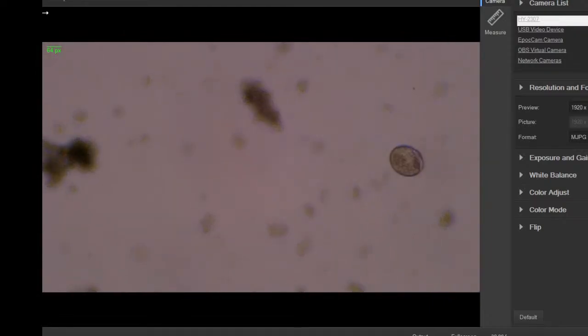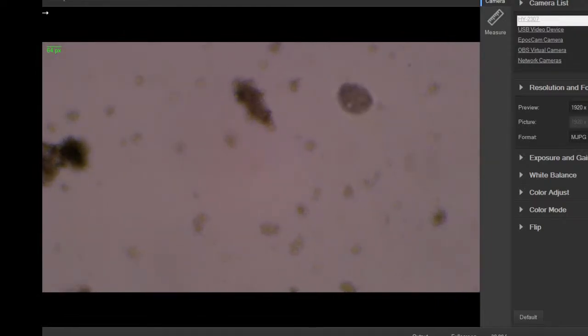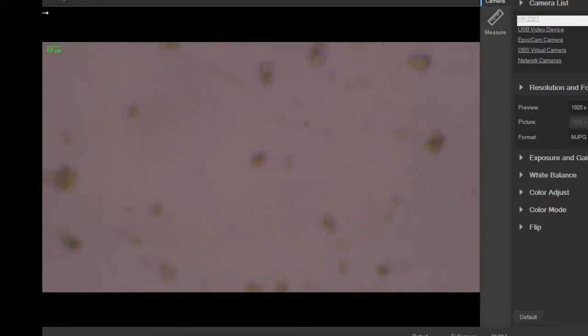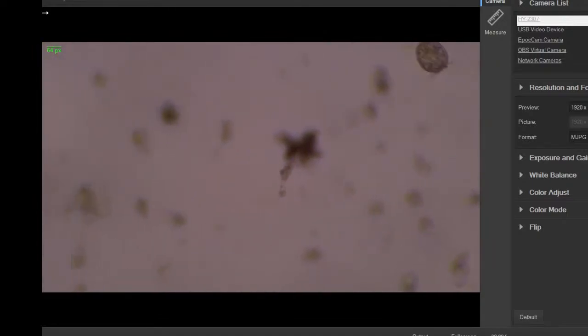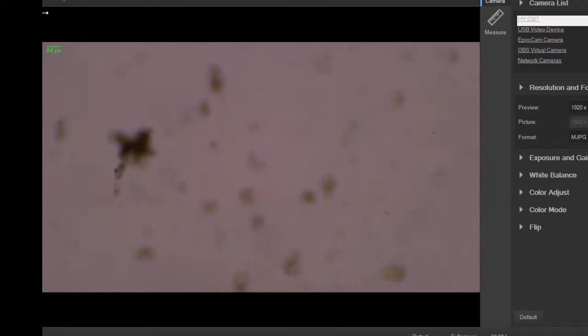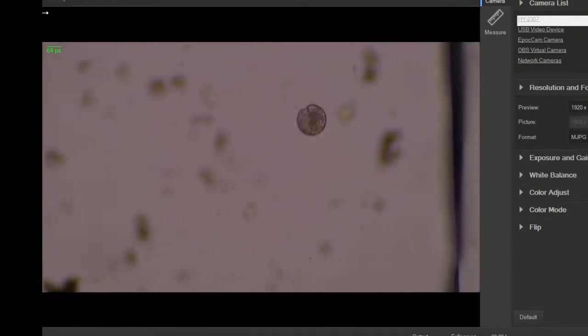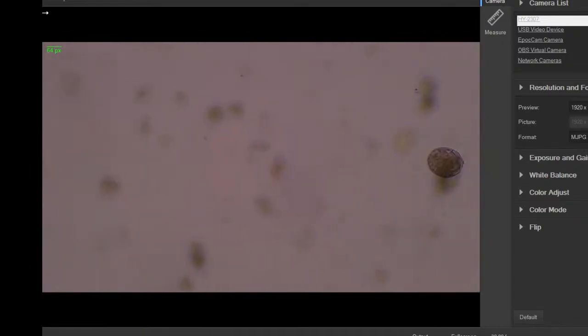Ooh, there's a Vorticella again, or something like Vorticella. The other couple look like this. Very jerky. It's like they're very sensitive, they get irritated, and they just pop, just kind of get away from what they think is possible danger.